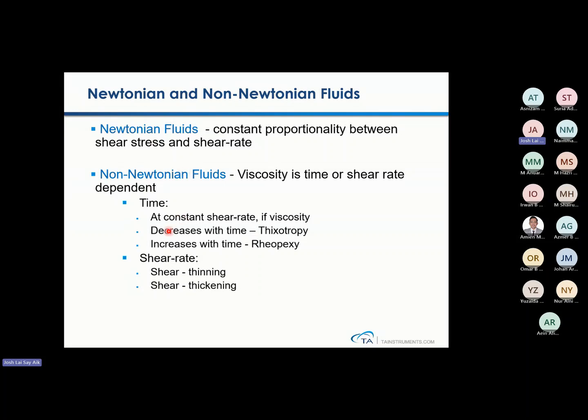Okay, so at constant shear rate, if the viscosity decreases with time, we name this thixotropic, like a paint sample. When it increases with time, we name this rheopexy, considering a single constant shear rate. Okay, so this is what we call time-dependent non-Newtonian fluids.